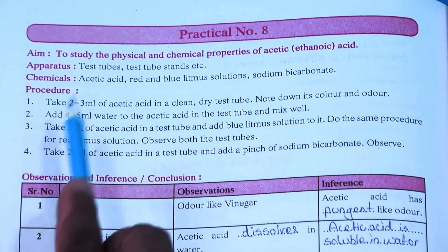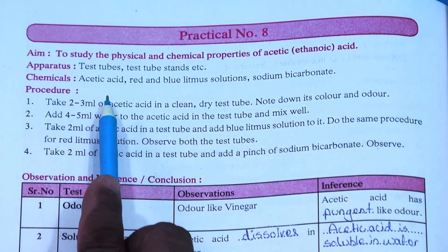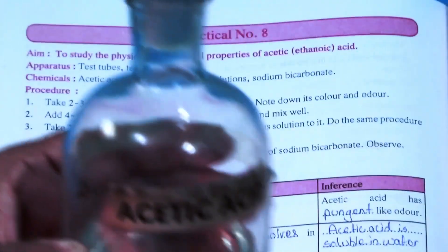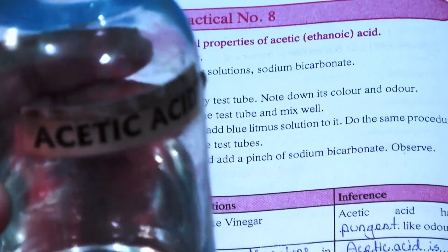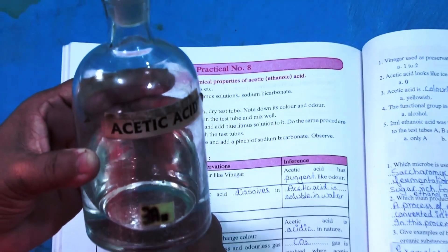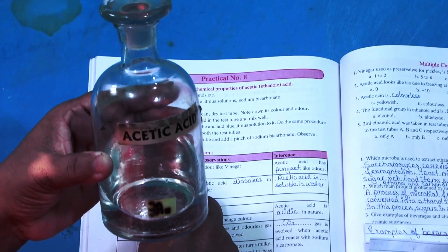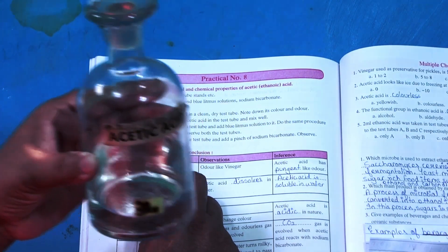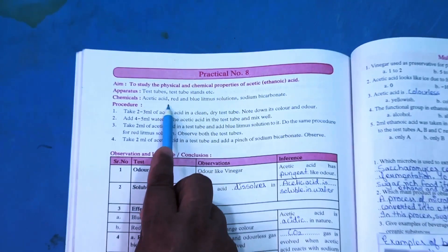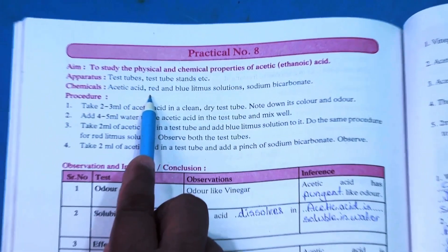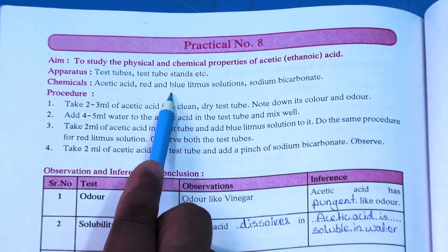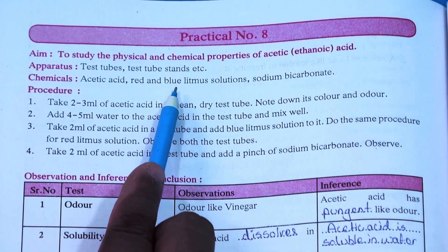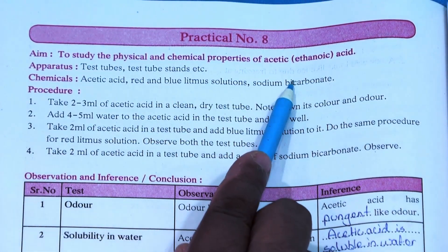The chemical we will be using here is acetic acid. I will be showing you all the materials together — red litmus, blue litmus, and sodium bicarbonate solution.